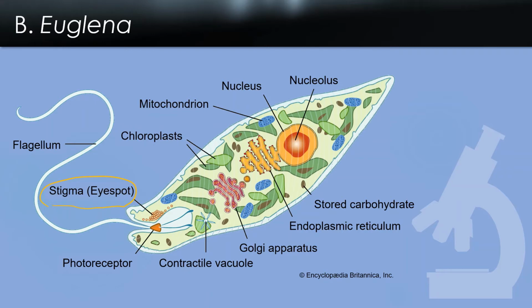You can see it has a number of other structures on there. They may not be visible on the Euglena cells. They're very small. Things like the contractile vacuole or the Golgi or whatever. And lastly, of course, you're going to identify the motility structure, which I think is pretty obvious on this particular diagram.